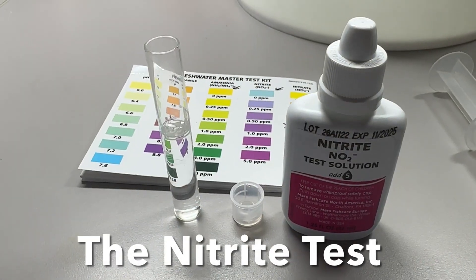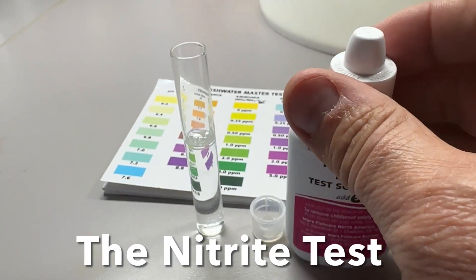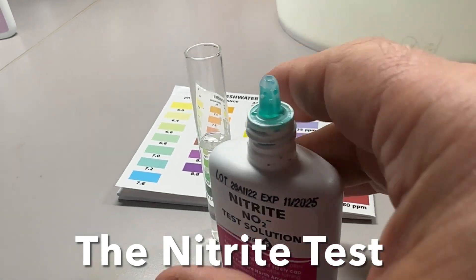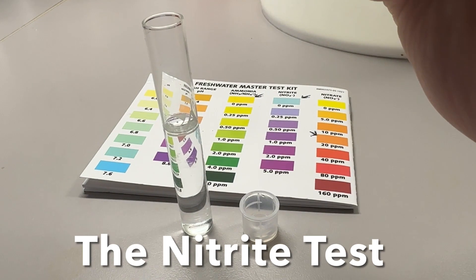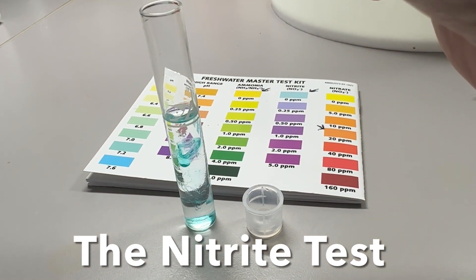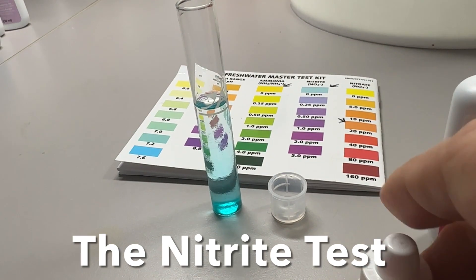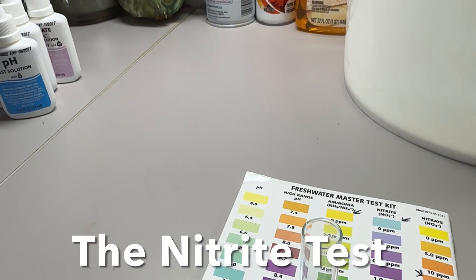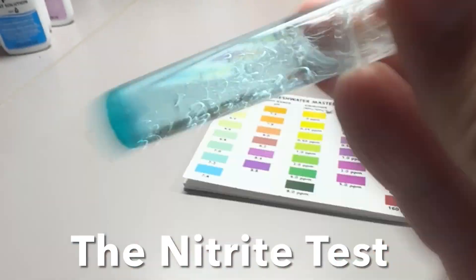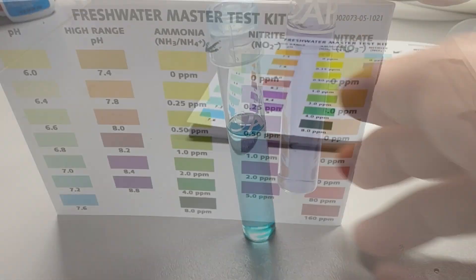The nitrite test solution is going to be five drops of uniform drops. First shake it up, then add the drops straight down: one, two, three. Shake it for five seconds — one, two, three, four, five — and wait five minutes for your result.